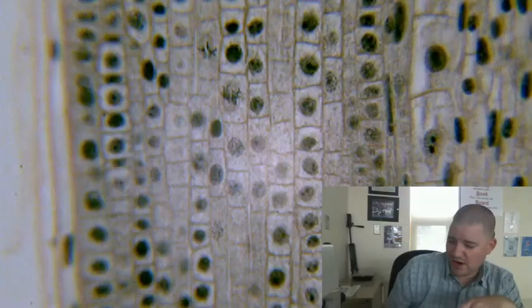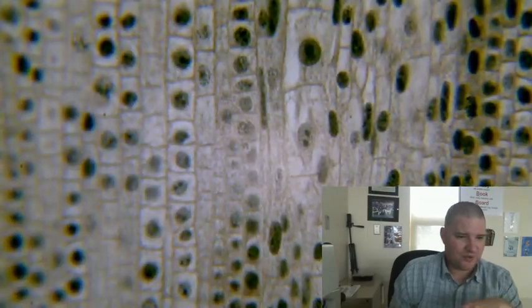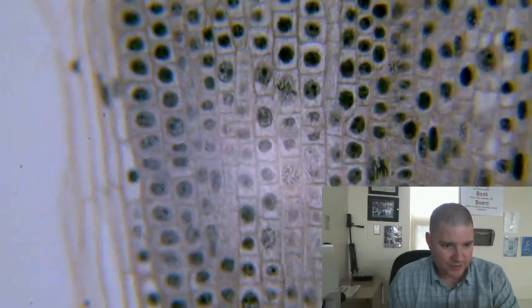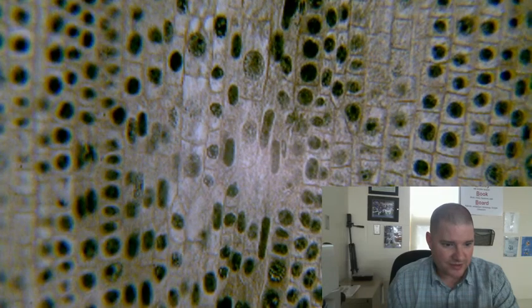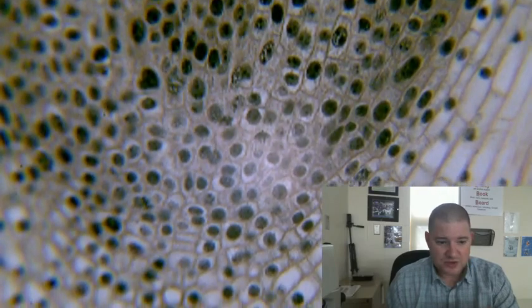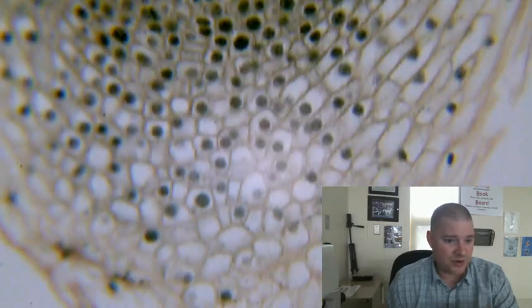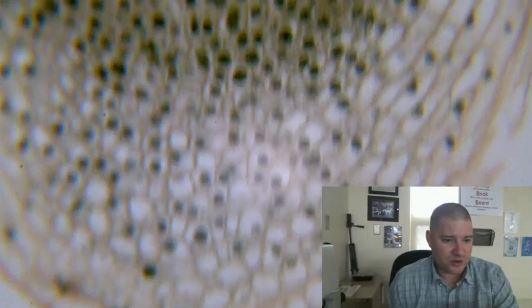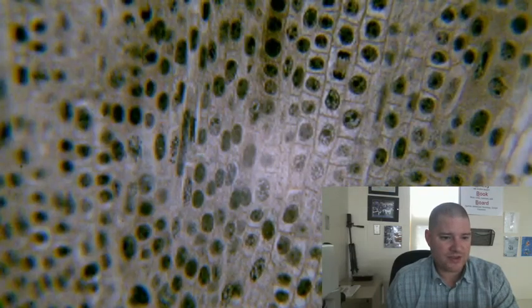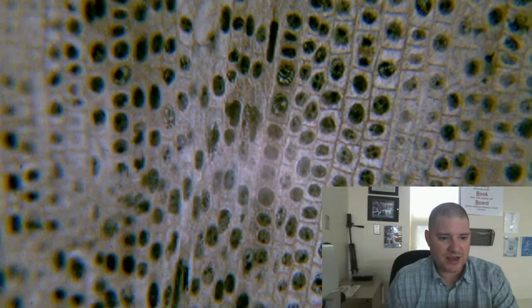It's a shame that you won't be able to be here in class, but hopefully you're seeing some of these microscope images here kind of get in play there for you. There's our metaphase again there. But you can see there's a lot of cells in there. The reason why we use the root tip is because they're growing. Because they're growing so quickly, we're able to capture more of the phases happening at one time.